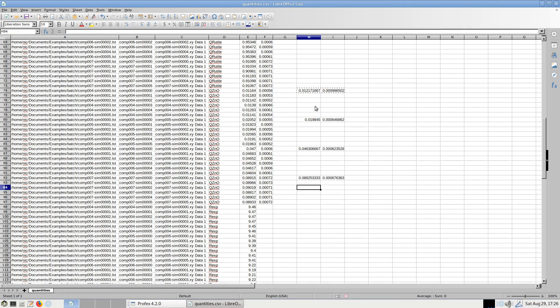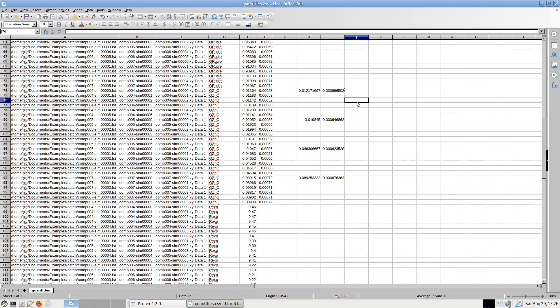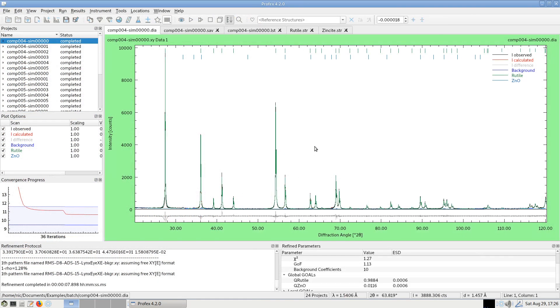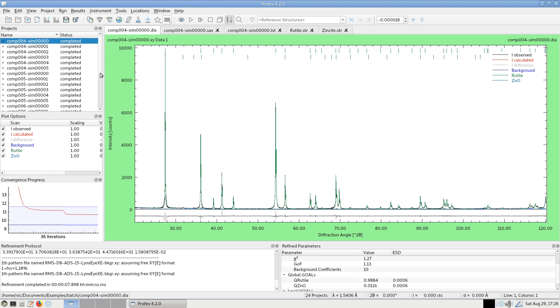And now I can do my statistics here. So these are my refined zincite quantities. Always the average of six repetitions and the standard deviations and I could plot them, for example, or do further processing with this result. These are the basic features of batch refinement in Profex. Now let me show you some more detailed information about managing refinement batches.